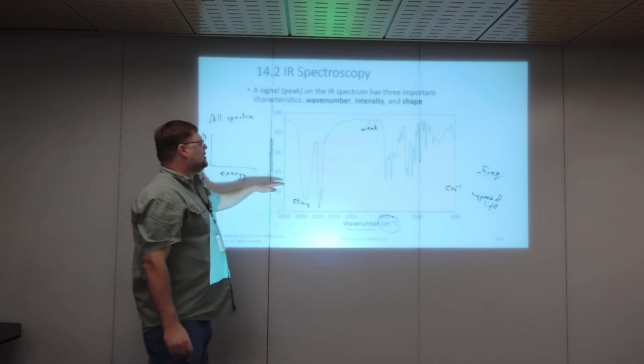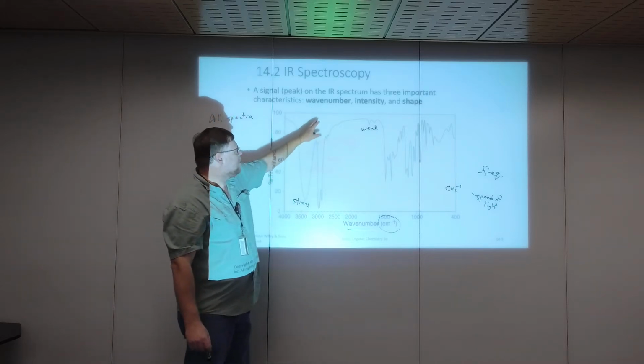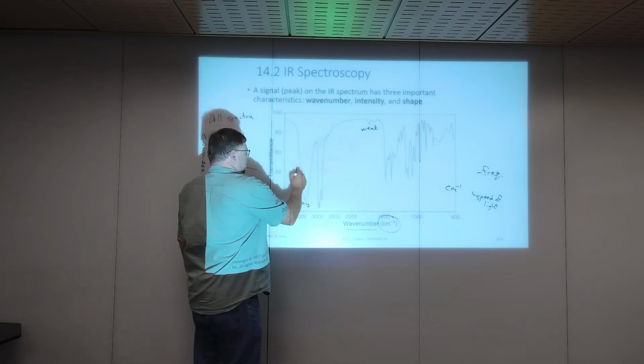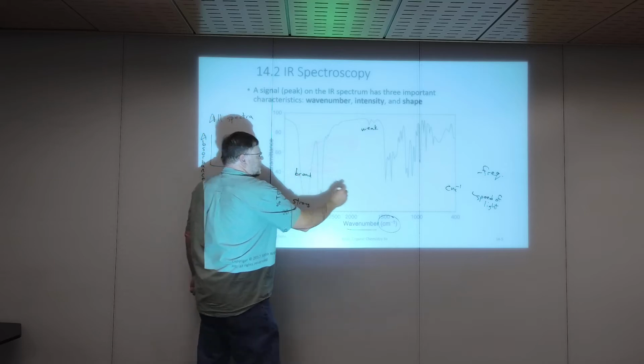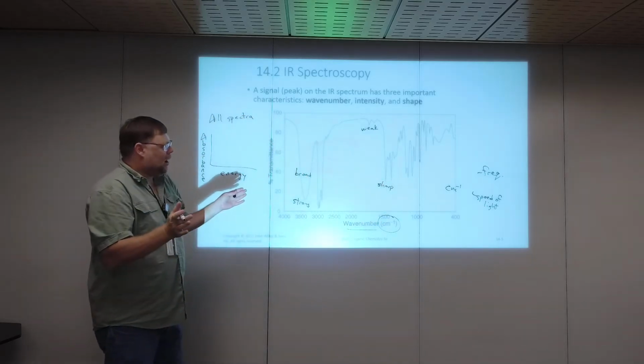This is the same spectrum, and it's telling you what I just told you. You want to characterize an absorbance band by wave number, intensity, and shape. Like this one is broad. This one would be sharp. So how wide is that band?